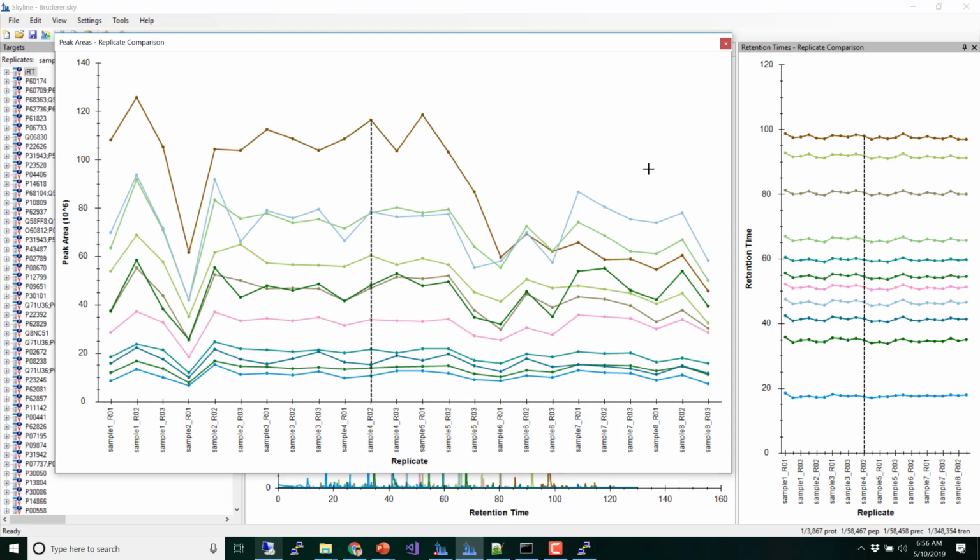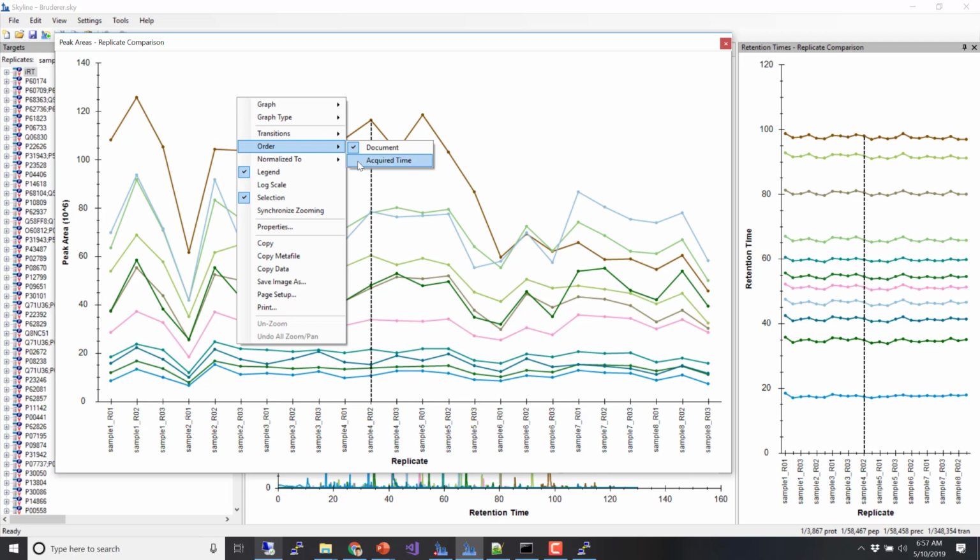And then they're going to want you to randomize within the block. Why? Because run order matters, and if you don't, then run order can become a confounding variable, right? You can end up seeing an effect, and if it's because your instrument kind of broke, then all of a sudden you have an effect that has nothing to do with the biology. It's just your instrument.